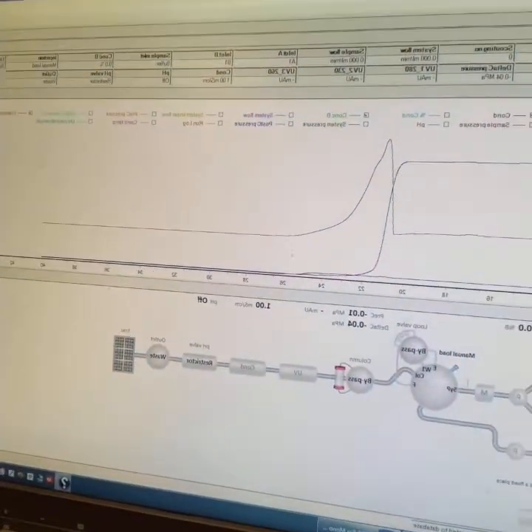But anyway, let me show you more about the ÄKTA because it can be really intimidating. When I first saw an ÄKTA I was terrified because there's all these tubes and stuff, but it's really not that big of a deal. You just have to learn what tubes go where. So if you're using the ÄKTA with the unicorn software, what's really nice is that it has this flow path monitor.